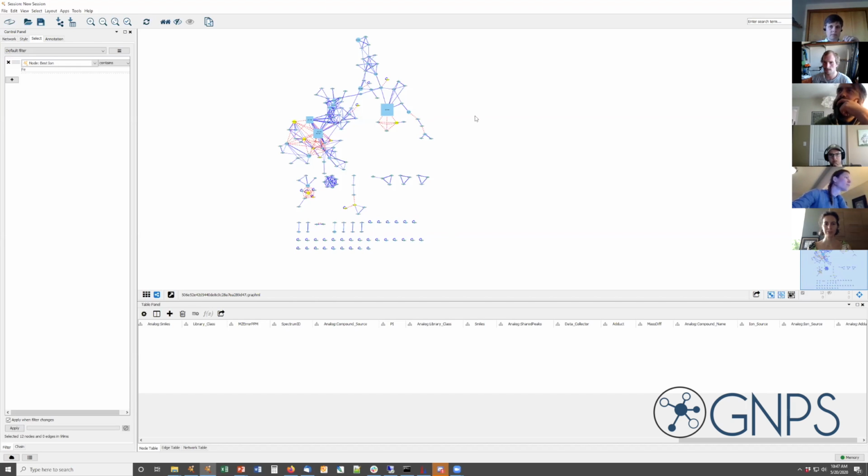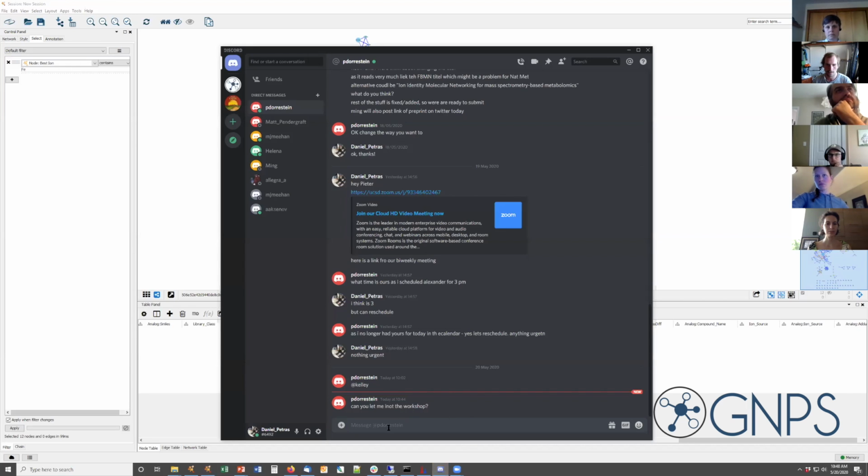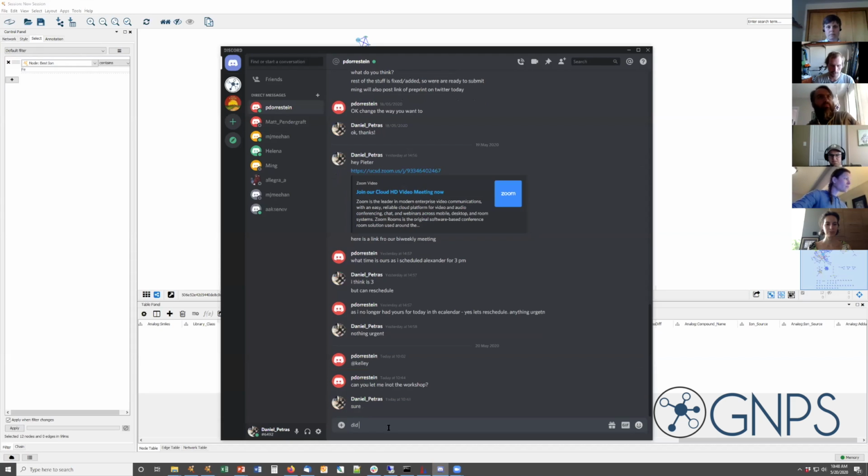What I personally also like to do is import the table into R or something, and then also make my own columns based on what I want to visualize. I also have columns for note, label, coloring, or shape, and then I can just define settings on those columns.